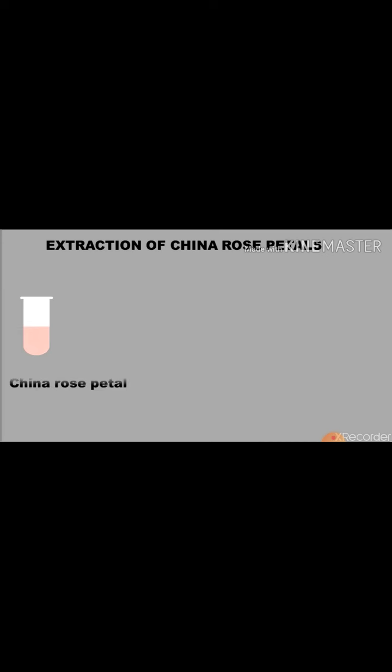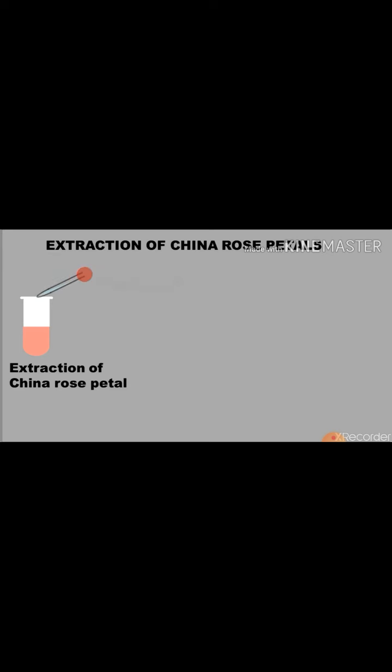Let's see how extraction of China rose petals is used as an indicator. Take a test tube half-filled with the extraction of China rose petals. Now add few drops of acid. You will notice dark pink or magenta color will appear. It means in the presence of acid, the extraction of China rose petals changes into dark pink or magenta color.